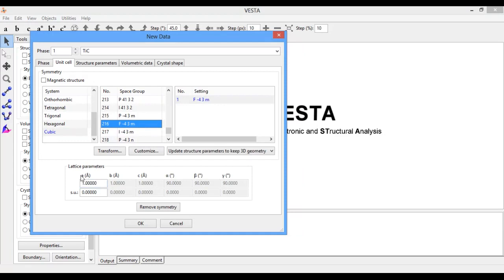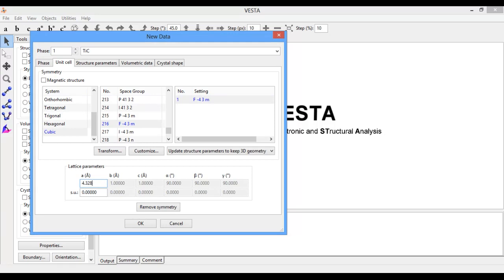The lattice parameter of titanium carbide is 4.328. Enter it here, and all the rest of the angles are also equal, so we do not need to put all the values. This one value is sufficient; it will automatically update the rest of the values.